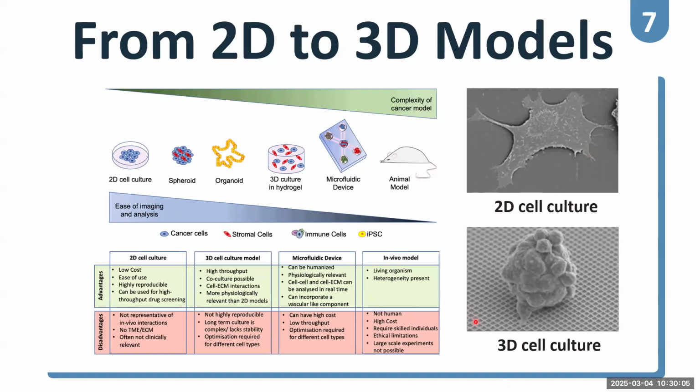Compared with the 3D structure like this, the media and the components that we put in the culture support the cells to grow in a 3D structure. So in this design, we allow the cells to grow in 3D, which quite mimics the real body of the real patient and leads to more realistic behavior, such as forming tissue structure.